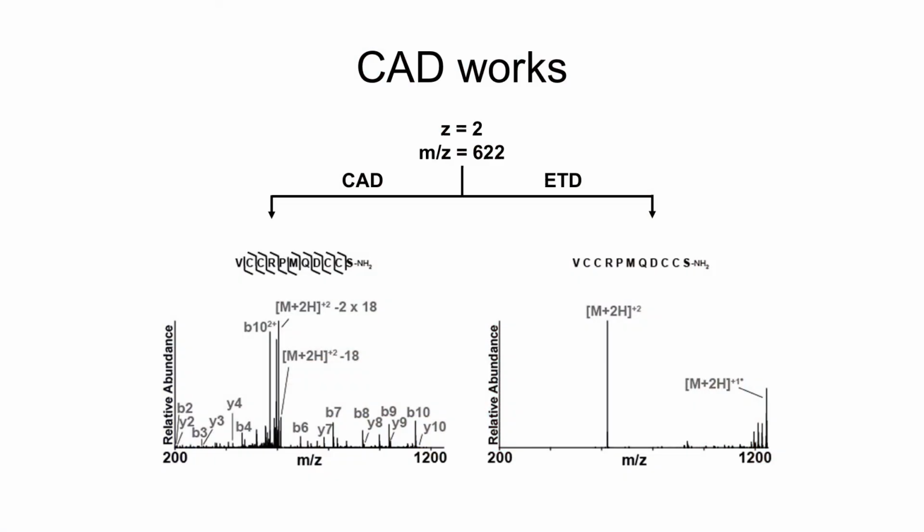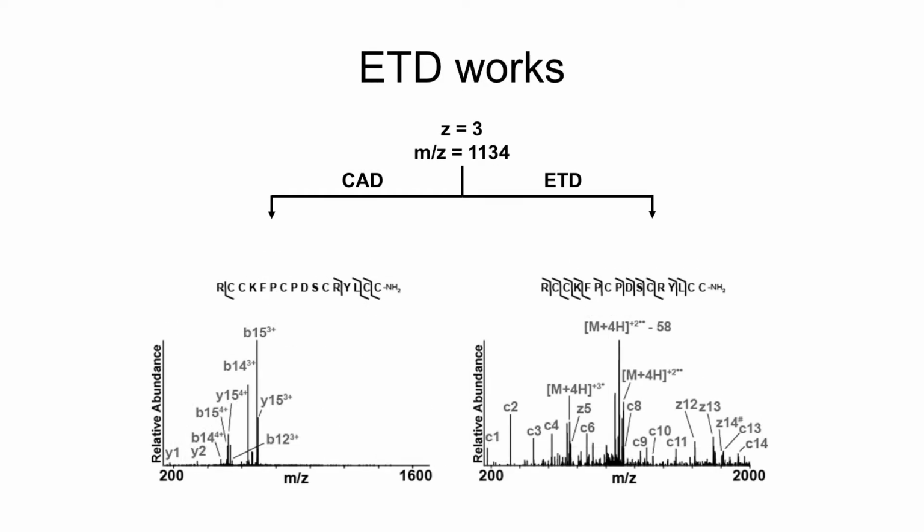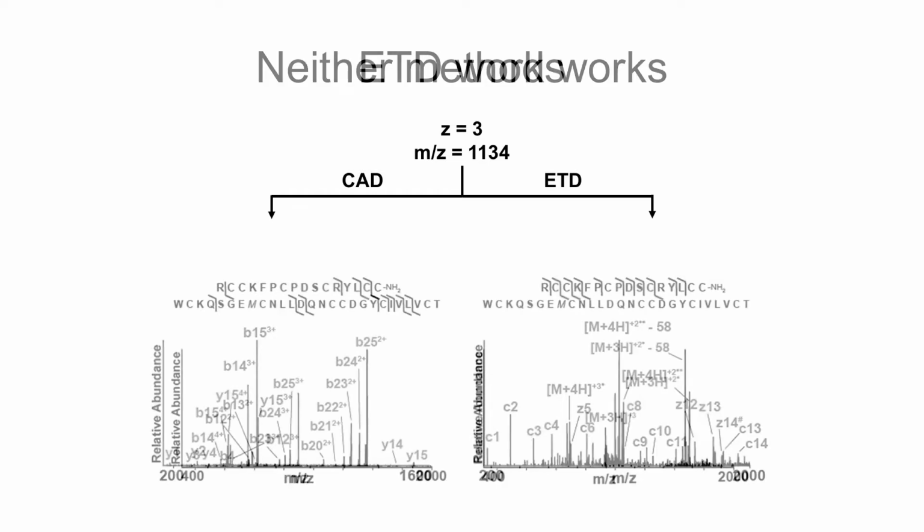There were so many spectra that were still not interpretable that clearly carried a sugar, but the sequence was not detectable. And they even found disulfide-bonded peptides, glycopeptides, that are represented here. These are class 2 peptides. So with this, I would like to emphasize again, certain peptides, like this one here, fragment beautifully with CID, but don't give us any fragmentation info with ETD. This peptide here in CID doesn't give us good fragmentation, but gives us beautiful fragmentation in ETD.